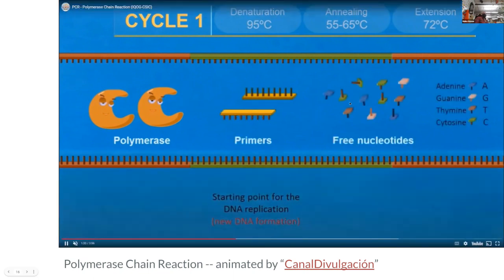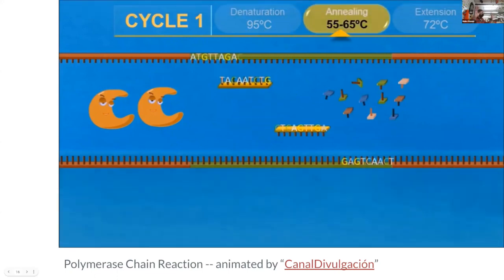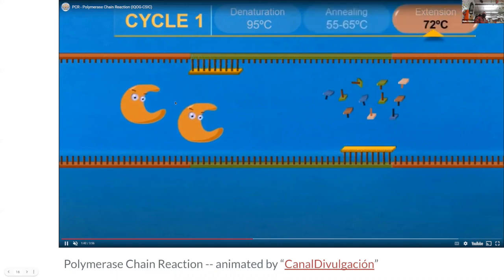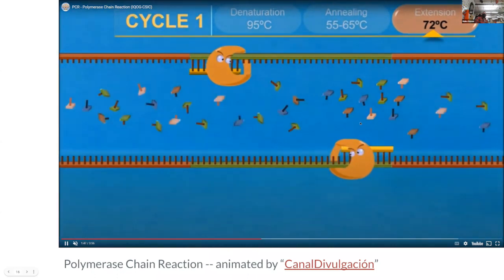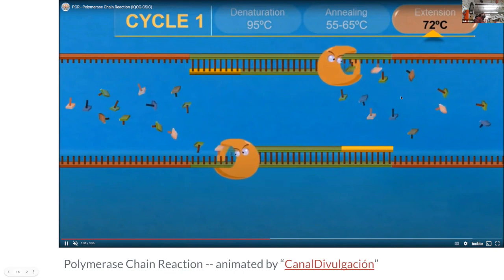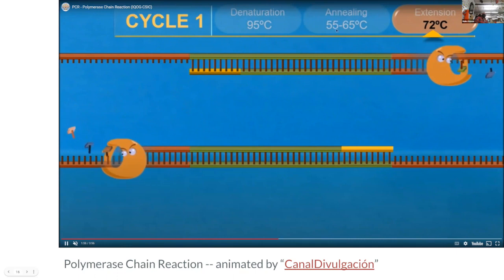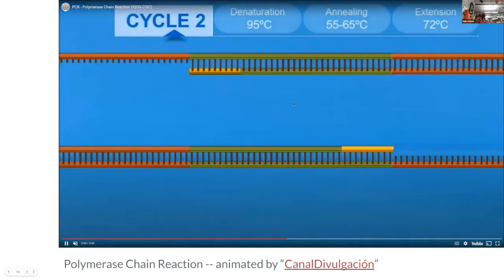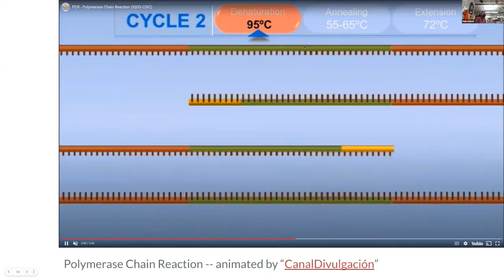And these primers will get it started. There'll be free extra letters of the DNA, extra segments. And so these attach right at your target point, and then the polymerase can grab on and it finishes up all of that after it loops around and sort of grabs all the letters that it needs to make copies of that part of your DNA. So this is what's going to happen repeatedly as it goes through the denaturization, annealing, and then it needs a little bit more heat to extend and anneal. And so you do this, and the only part that's really actively being copied are these green sections.